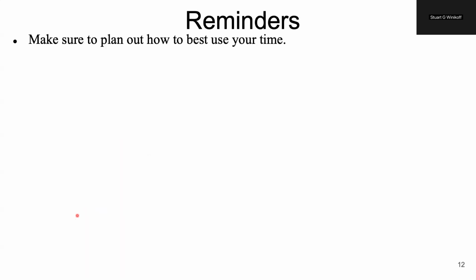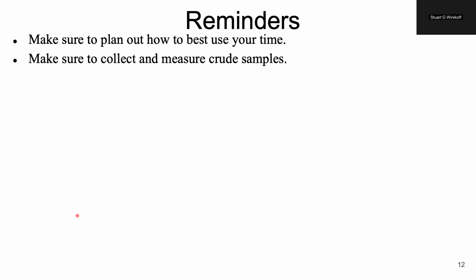So some big reminders when doing this. As you may notice, there's a lot of steps to this, including several steps where you have to go ahead and wait for things to heat up, cool off, or even just dry out. So make sure you plan your time accordingly and always get the next step ready. If you ever find yourself sitting around, that would be the time to do math. You can go ahead and wait for your math if something else needs to be done.